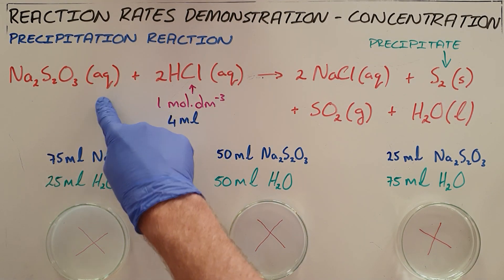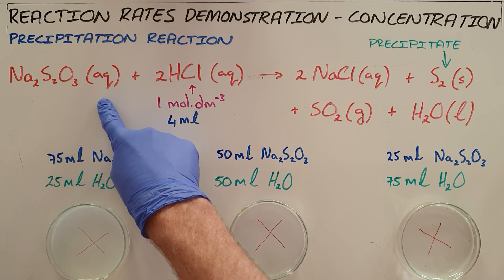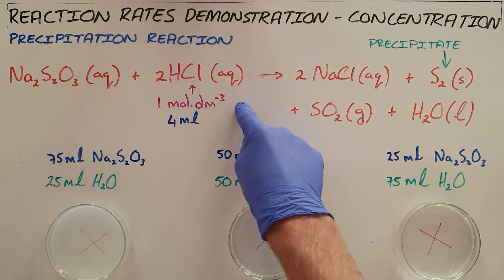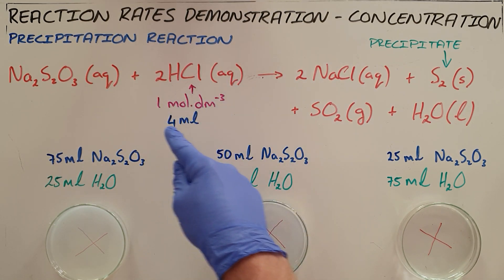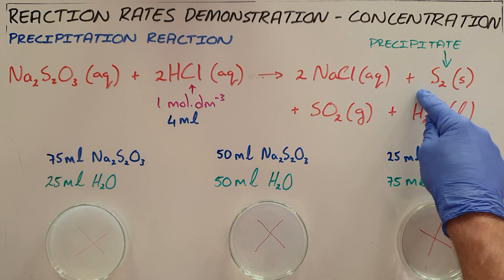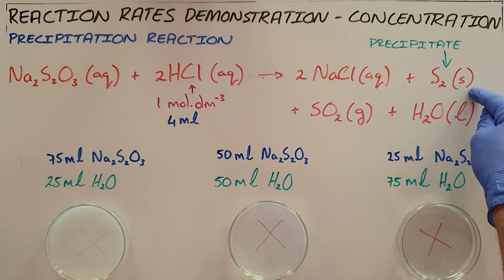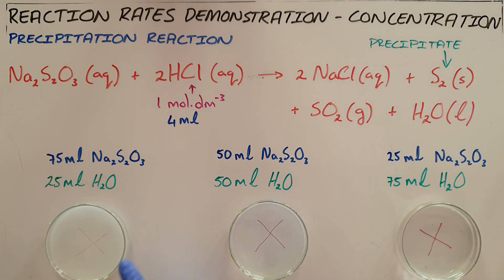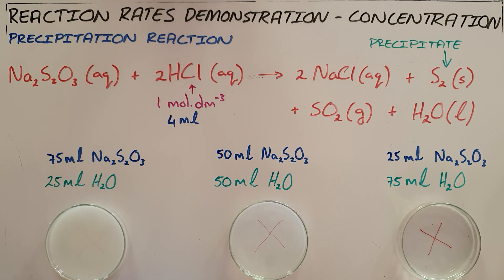Therefore there would be more collisions between sodium thiosulfate and hydrochloric acid, so we would expect the precipitate — that white powder — to form faster, which is what we see happening here. The white powder drops to the bottom of the petri dish, forming a layer that stops us from seeing the X marked at the bottom.